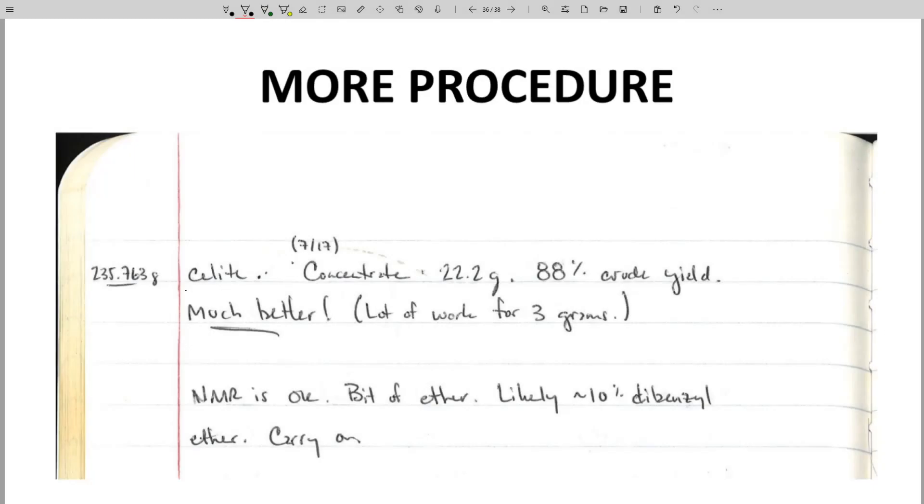There isn't a lot more to the procedure. Note that the previous sentence only needed one more word. The next sentence starts with a new date. So the previous page was dated 7-15, July 15th. Apparently, I took a day off before I finished this reaction and picked it back up on 7-17, July 17th. If the date changes, you need to make a note to that effect in your procedure. We also see that the final yield of this reaction was 88%. That's a crude yield because I didn't do a purification. Why didn't I do a purification? Well, the next line says that the NMR looked okay, apparently good enough that it didn't feel that the product needed to be purified. I did notice a couple impurities, some ether, and a bit of another side product. How would I find this NMR spectrum? It's not in the lab notebook. The previous page was page number 40.